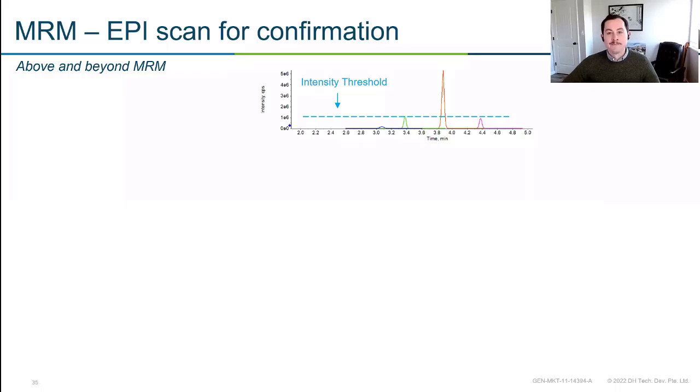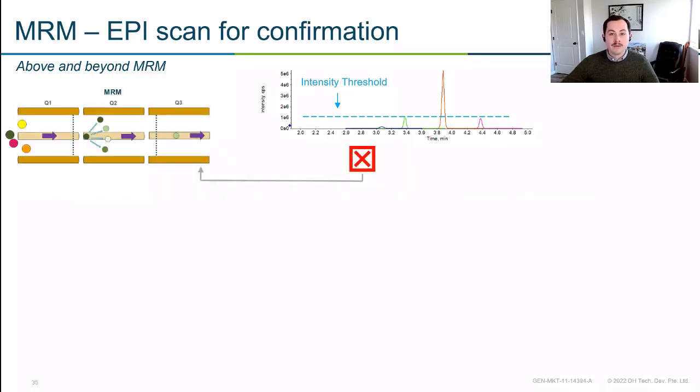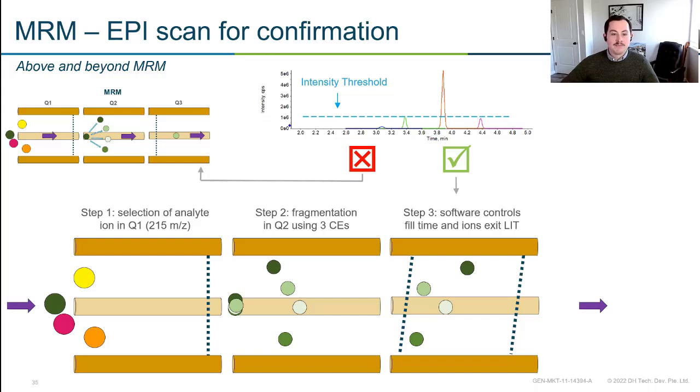What does this look like? So for an MRM EPI experiment, we'll start out with our MRM experiment. So here we have an XIC. So we've got, again, that extracted ion chromatogram with all our peaks. And we apply some sort of intensity threshold. And we're looking for a compound that passes or surpasses that intensity threshold. If the compound doesn't, like that compound in the dark blue, we'll just move on to our next MRM experiment and continue down the line. If it does meet that threshold, what we'll end up doing is our EPI experiment. So here is where we're going to create fragments and essentially read them out to get the compound's fingerprint.